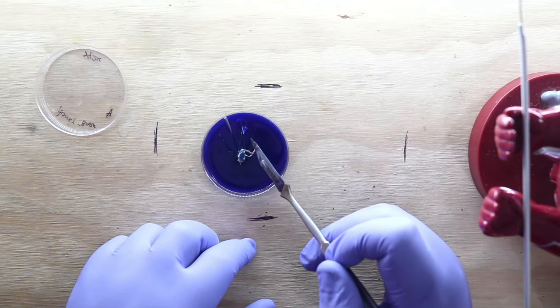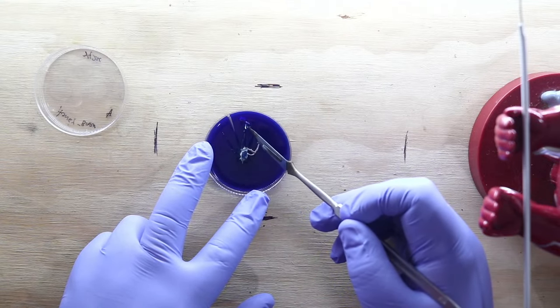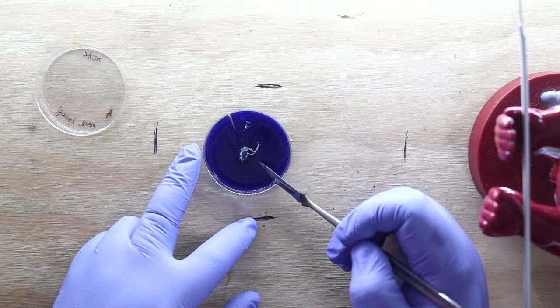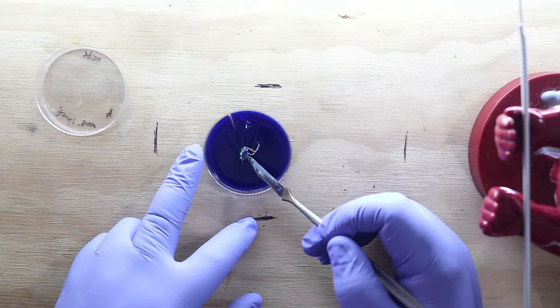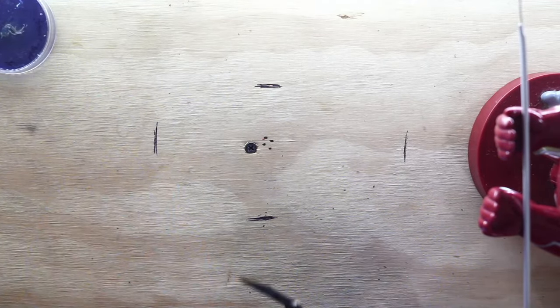So these tentacles, rhizomorphs, you can cut up and move around. I've used those. That works for anything that produces rhizos, like cubensis or anything else. The honey mushrooms are something that we just started playing with because I brought these about from Spore. So, let's go to another dish. And let me clean my blades.